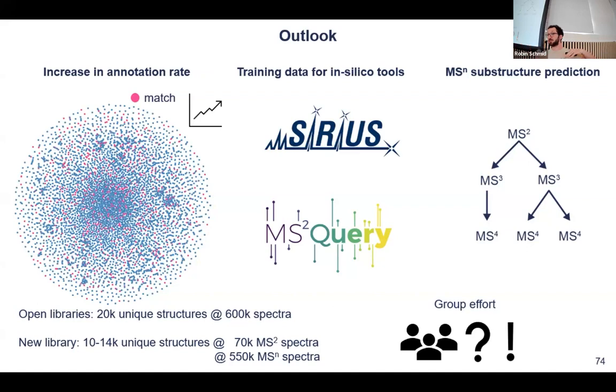If I just use the maximum intensity across the 3 different energies, at least that's the raw intensities that I got from the instrument. If I sum them up, or if I average them, of course, there's going to be some discrepancy between smaller and larger peaks. We did not really check how much it improves the quality.